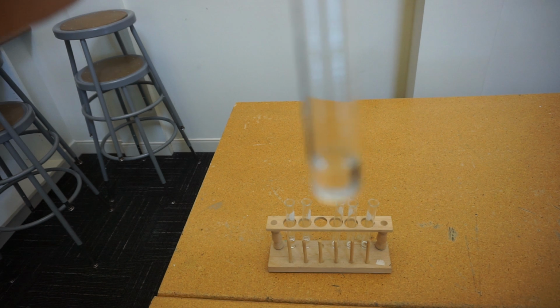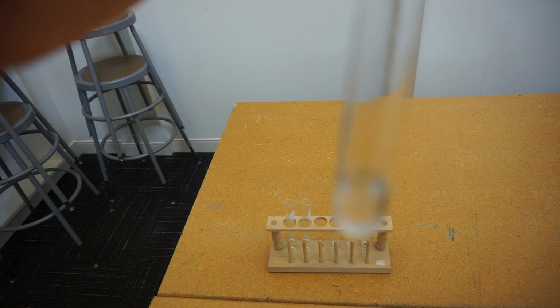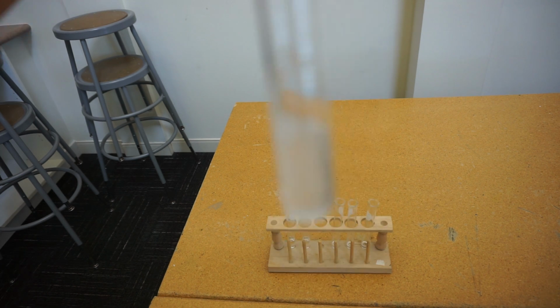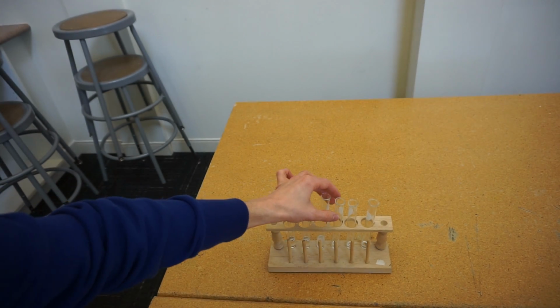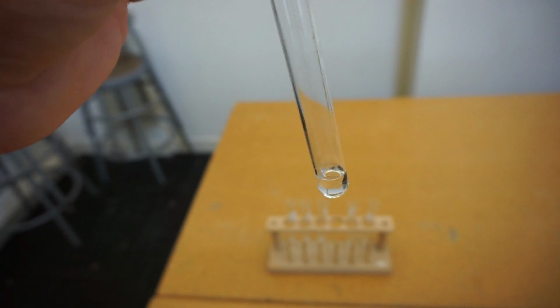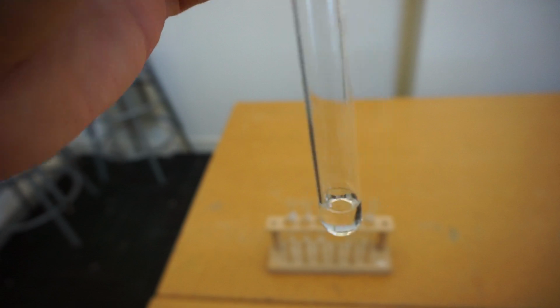Our next one is propanol. And again, add the water, give it a shake, and we see that we're just getting a good clear solution, good mixing. So all of these so far have shown good mixing, and the hydrogen bonding between the oxygen of the alcohol and the hydrogen of water, or vice versa, showing good mixing.